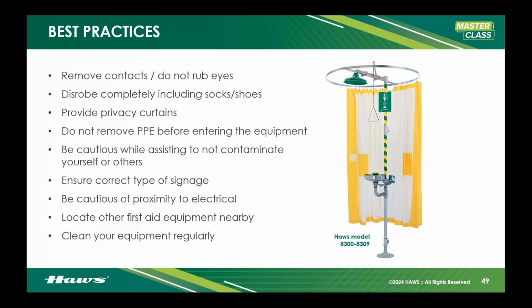You've got to be in your birthday suit. You've got to disrobe completely. It is not time to be shy in front of your coworkers. The likelihood that the contaminants are going to get trapped in your clothing, run down into your socks and shoes, etc., is highly likely, and you want this off of you as fast as possible.